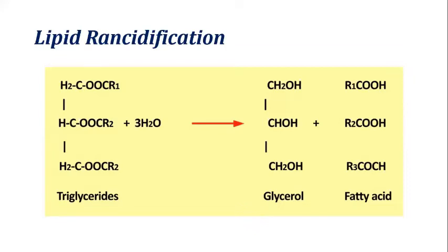So when there's a higher fatty acid level, that means the quality of that oil is less, and this can also be used as a measure of the shelf life of an oil. When oil is stored for a longer period of time, usually the fatty acid content is higher. That means that oil is old.